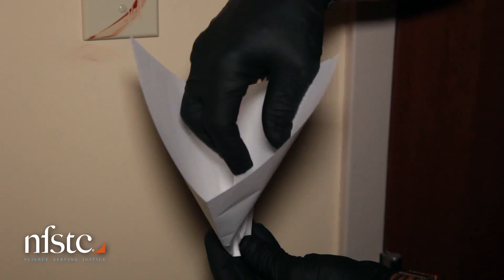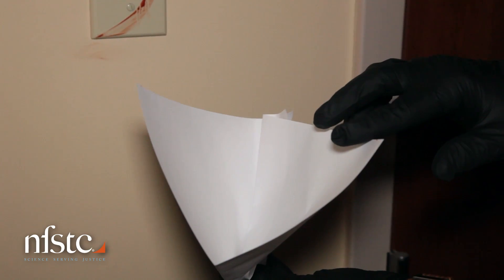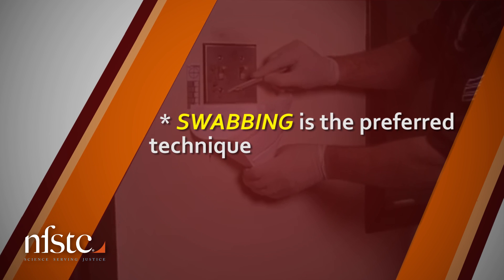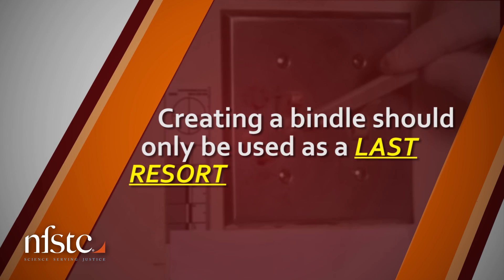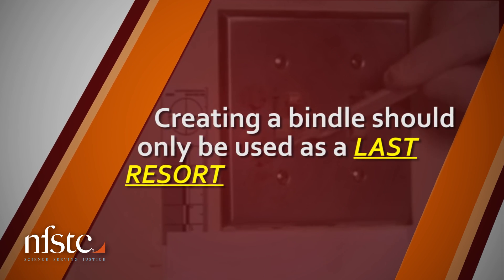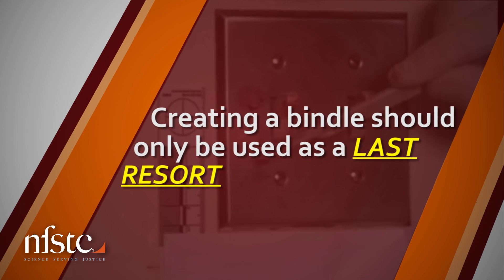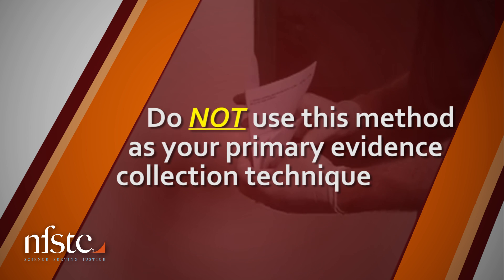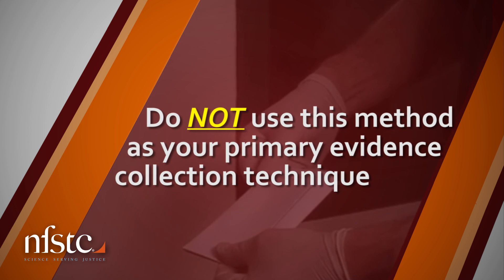Here is a quick step-by-step guide for creating a bindle for evidence collection. Please note that whenever possible, swabbing is the preferred technique. Creating a bindle should only be used as a last resort when appropriate evidence collection tools are not available. Do not use this method as your primary evidence collection technique.